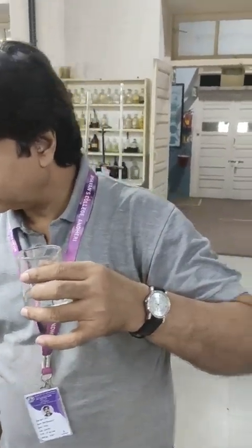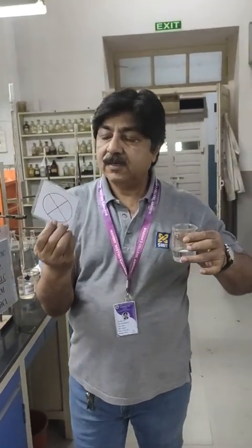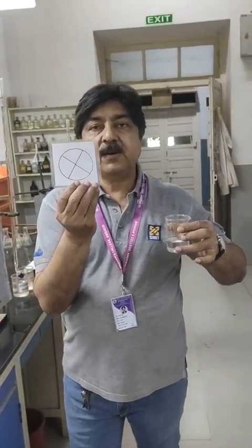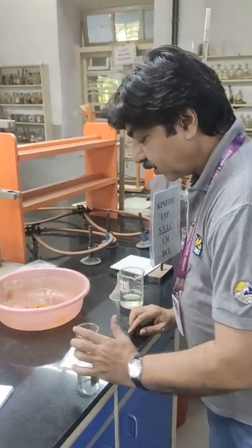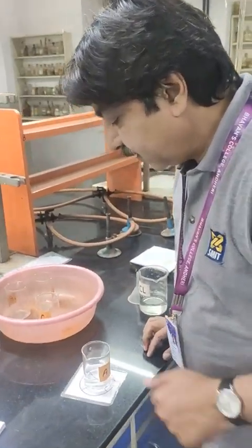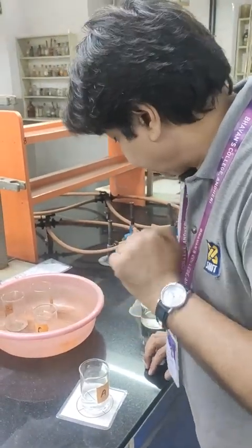I will place this piece of paper on which I have drawn a circle consisting of a cross mark, and I will place this container on the cross mark. Now this cross mark is visible when I see this solution from the top.